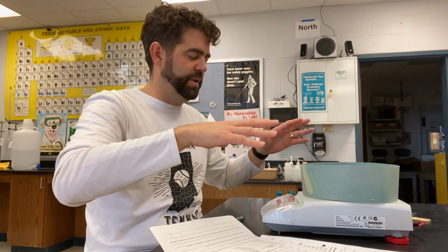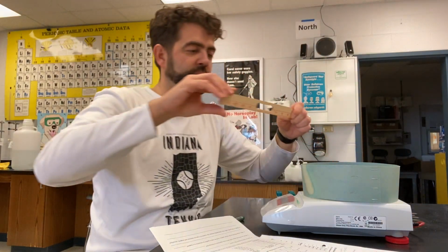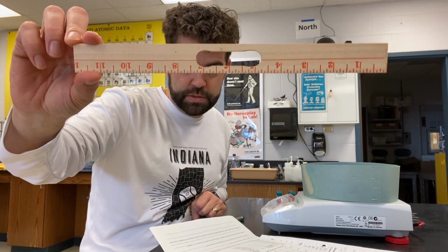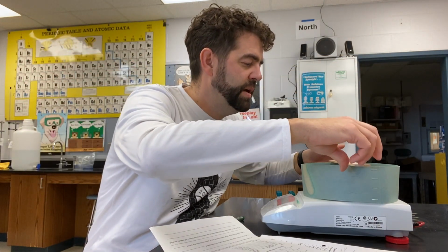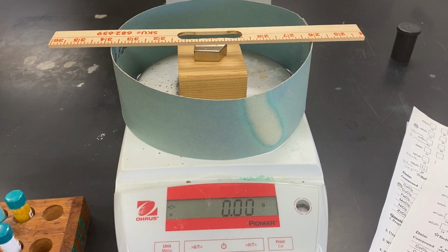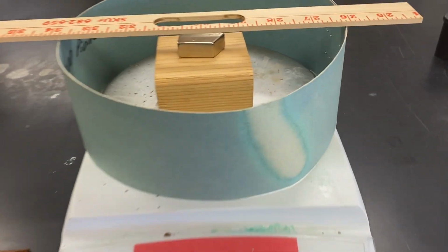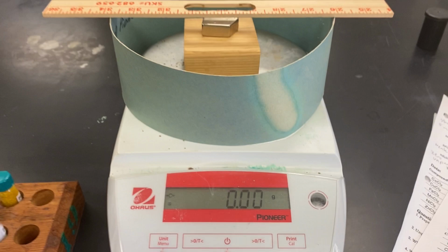If it doesn't touch the pan, then what I can do next is put this very fancy ruler that has a slit, put into it, and I'll put that right on top. So basically I'm making like a little bridge here so that the ruler is not touching the magnet. All right, here's kind of a close-up view. You can kind of see what's going on here. But that magnet is not touching that ruler, which is great. And you can see it has zeros right here.